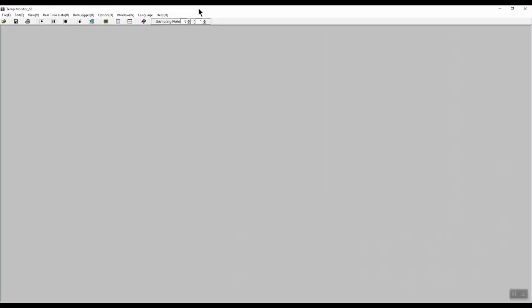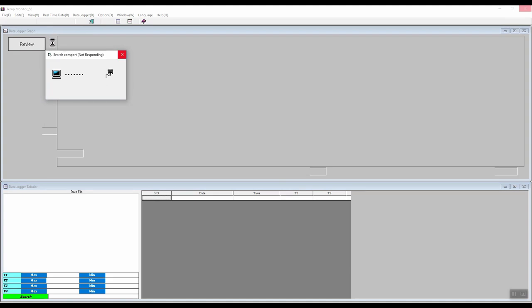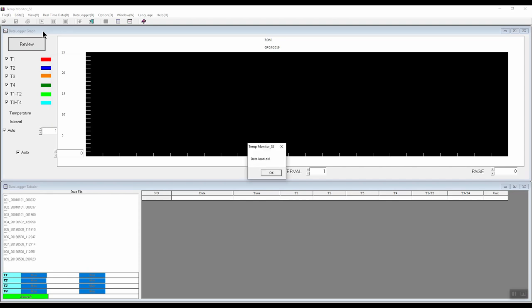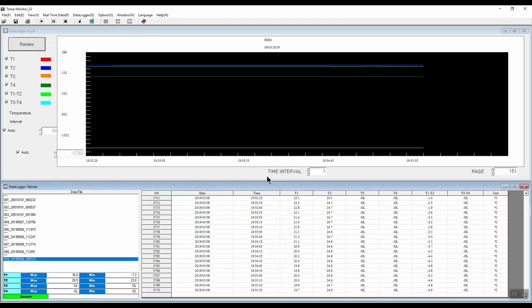We can now load the software. Let's expand this window. The first thing we need to do is ensure the data logger is set to auto mode for the connection. Go to options — make sure auto scan com port is highlighted and click OK. To download the data, go to data logger and click ON. This will communicate with the data logger to download the data, and this will take a while. Now the data has been downloaded, we click the OK button. We'll remove the channels we're not interested in, leaving T1 and T2 selected, then click on the review button.